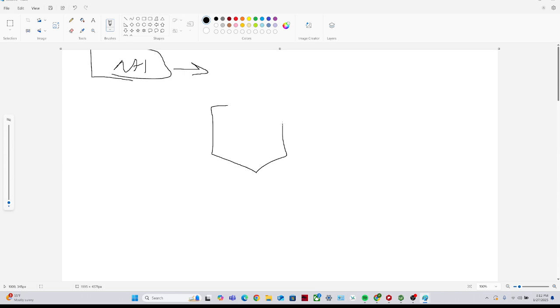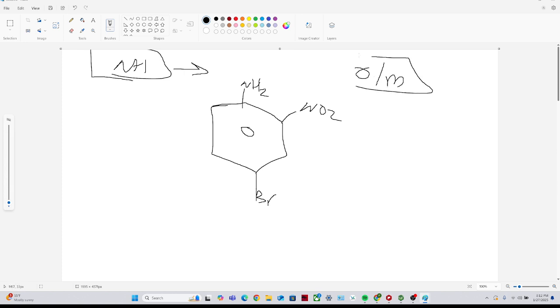Well, in the case of our structure, and I'm not really going to go into why this happens. It really has to do with bond rotation and angles, but that's beyond the purpose of this class. Actually, let me redraw this similar to the last structure. If I were to draw this compound, I'm telling you right now that ortho and meta positions couple to one another. What do I mean by that? So I'm going to draw all these H's out again, and I'm just trying to be consistent. This is HA. This is HB.